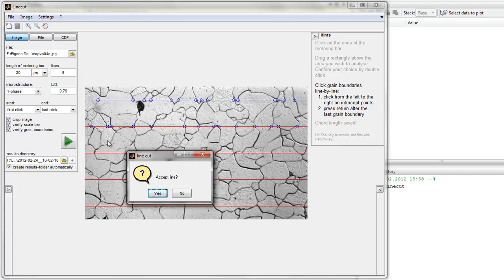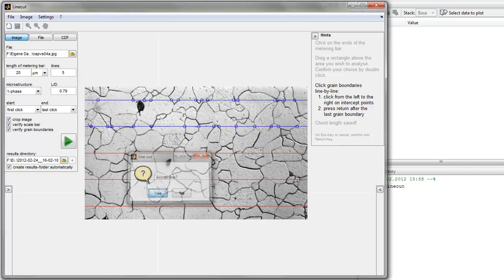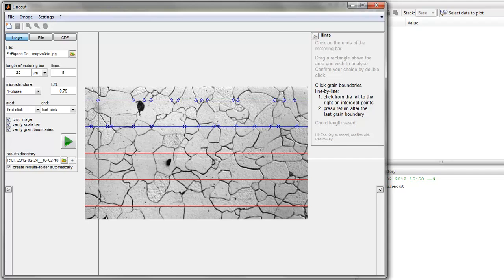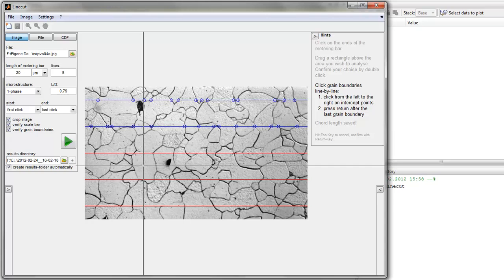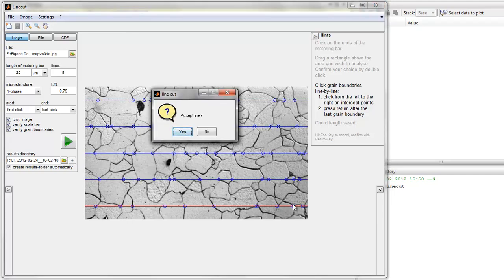If you want to redo this line you can click 'no' and restart the line — only that line. If you want to cancel this analysis you can hit the escape key and confirm it with return. If you do not want to be asked whether the line is okay you can deactivate this option too by unchecking 'verify grain boundaries'. You can also uncheck 'crop image' if you don't want to select an area before the analysis starts.